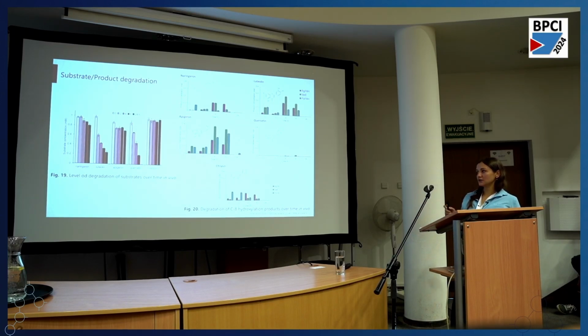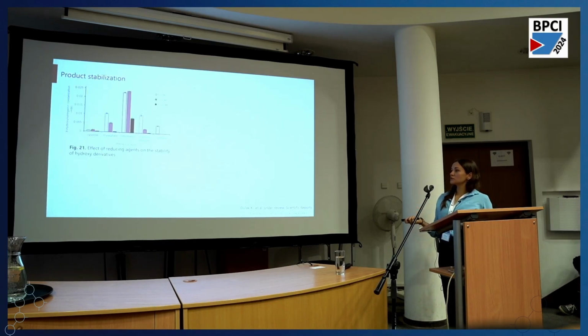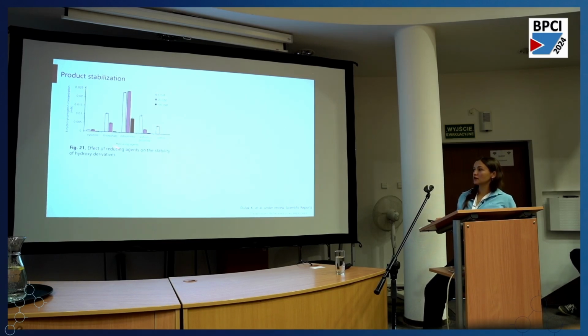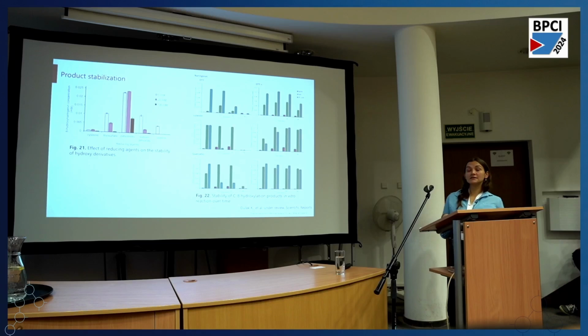So we decided to switch to the in vitro reaction and manipulate the redox potential, for which we chose 4 compounds, and that gave us results showing that dithiothreitol was able to improve the stability of our product.